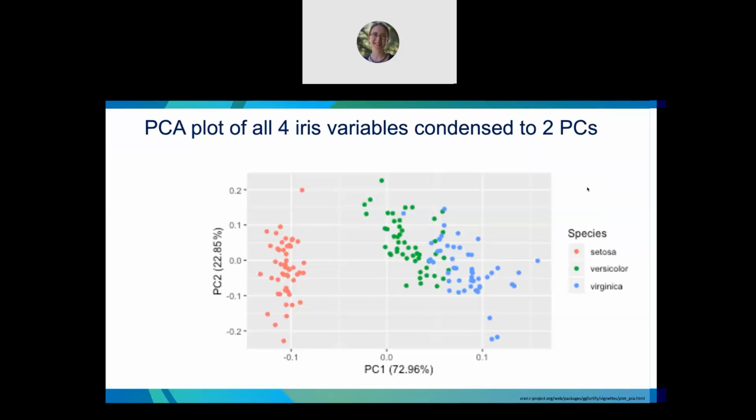So there are places where you could stand in my house where you wouldn't even see this separation between red, green, and blue. You could pick a bad sight angle where they all seem kind of mixed together and very clumped together. This is a really informative sight line into my fish tank. So I think of PCA as the way of finding the best sight line on my fish tank, even if my fish tank is in 4 or 5 or 50,000 dimensions.